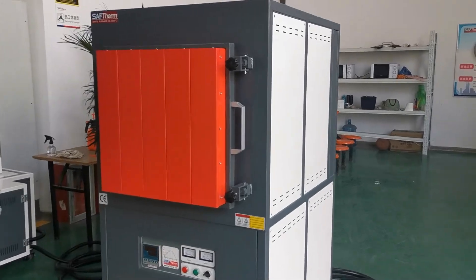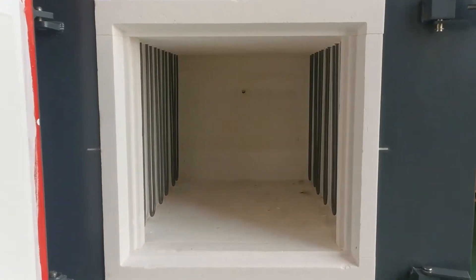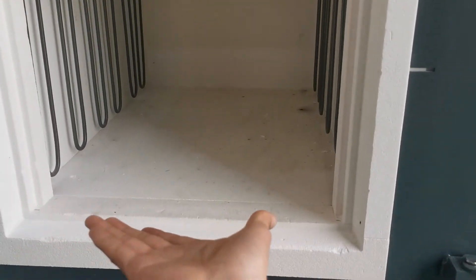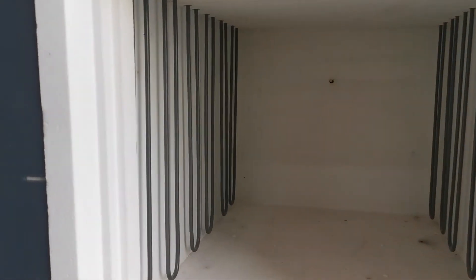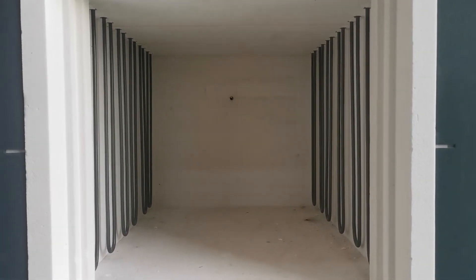Now let's open the door. The furnace chamber capacity is 96 liters. The chamber size is 400 by 400 by 600 millimeters. The heating elements are MoSi2 rods, heating from two sides, and the thermocouple type is B-type.